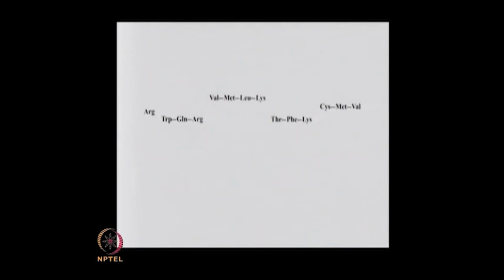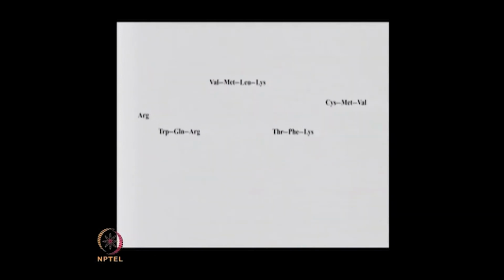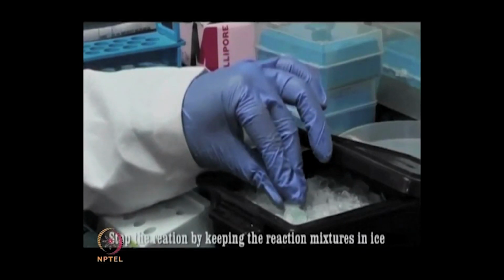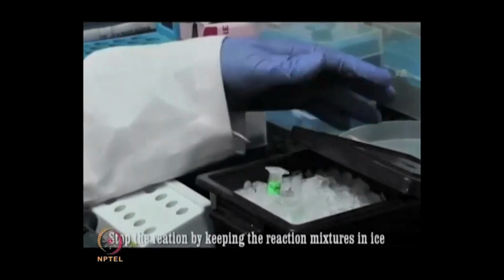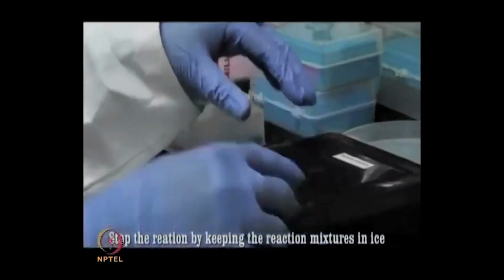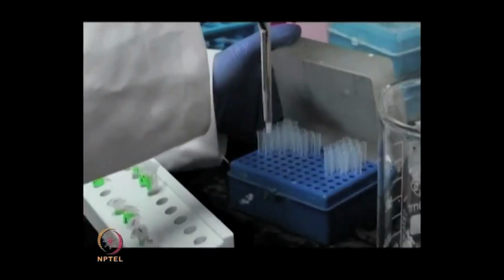So, prior to MS identification, proteins are digested to generate peptides. There are several proteolytic enzymes available: chymotrypsin, trypsin, pepsin are some of the enzymes commonly used for proteolysis. After the overnight step, you have to stop the reaction by keeping the reaction mixture in ice.